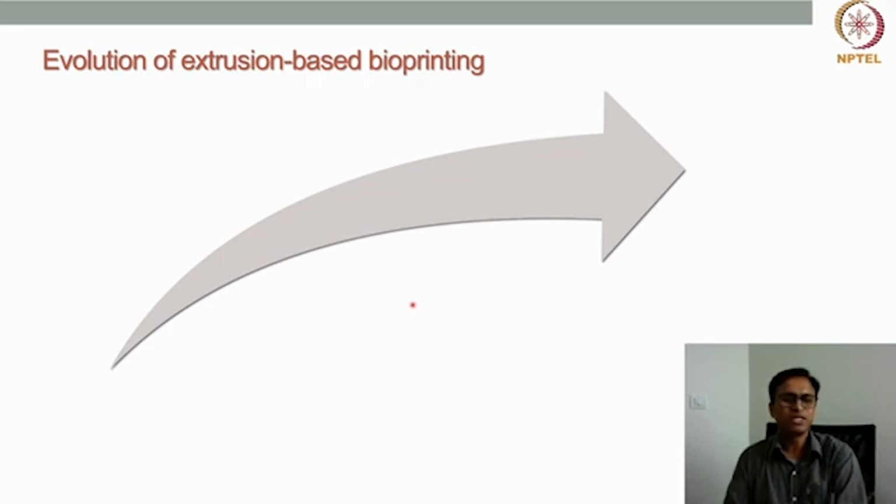How are they being printed? These thermoplastic polymers are put through a print head. Those thermoplastic polymers are first heated to a certain temperature until they liquefy, and when they are liquefied, they are pushed through the nozzle. Then this molten thermoplastic polymer that comes out of the nozzle, we plot those filaments, and then we produce the 3D structures.